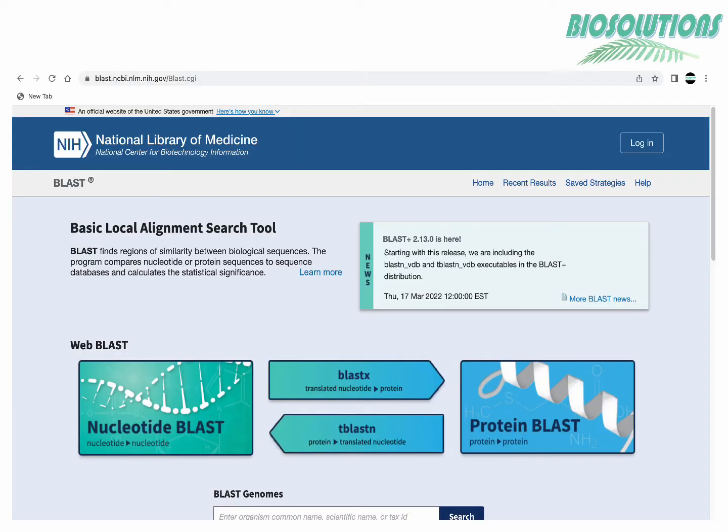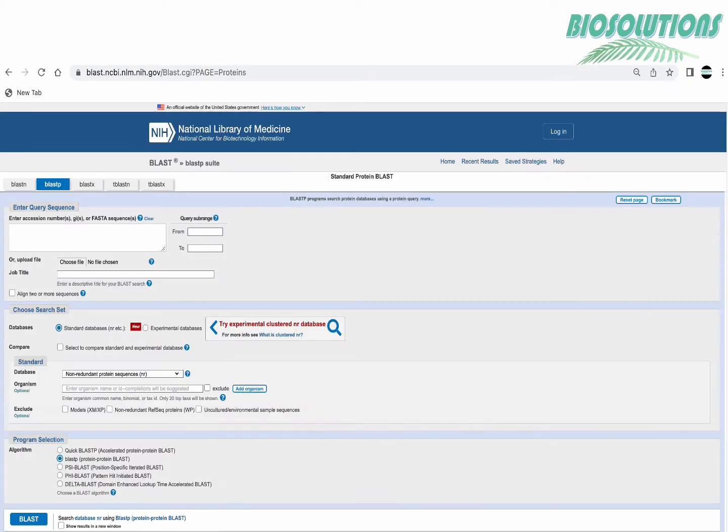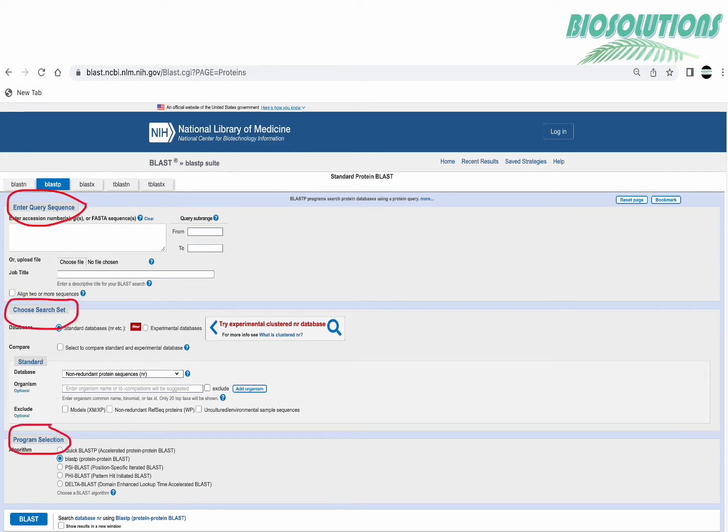This is the BLAST homepage and we click on BLAST-P now. Here we see a form which has got three sections: enter query sequence, choose search set, and program selection.